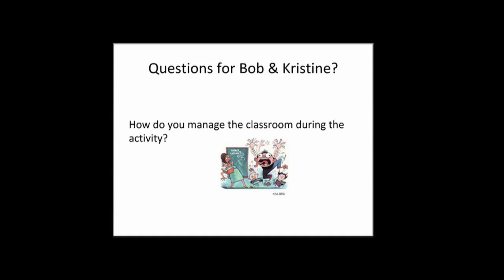Great. I'm going to address a couple of the questions. Sorry, I'm going to jump in. No problem. Some of the questions regard safe handling of nanomaterials. I just wanted to point out on nano.gov, there are some resources that have been developed by some of the agencies that participate in the NNI regarding safe handling of nanomaterials.